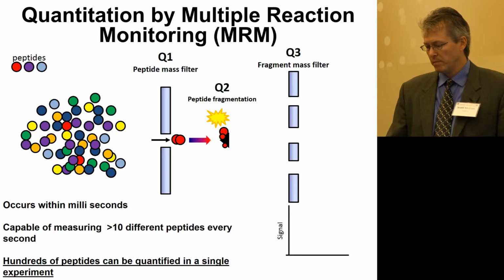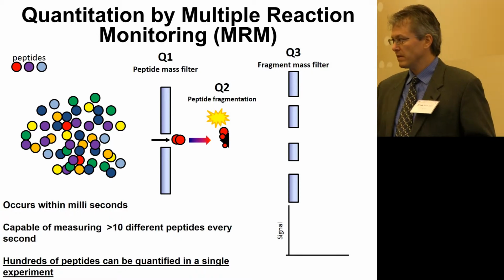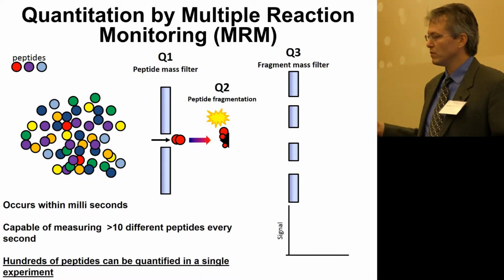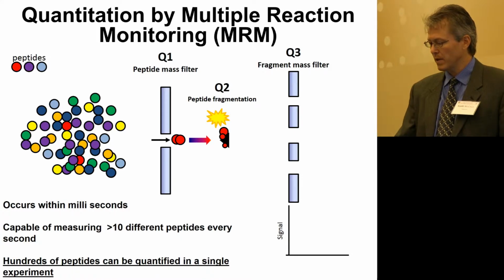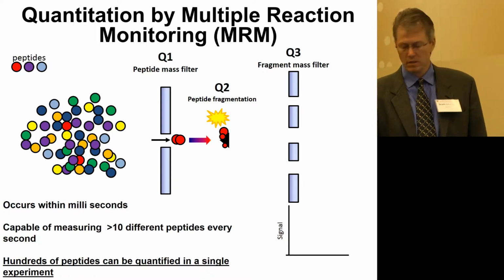Then you're going to break the peptide bonds. They're fragmented to provide the amino acid sequence information. And so that final signal is specific for the peptide of interest. Mass matters and gives you the sequence information. They can keep track of that and measure it. And then you do get the signal there at the bottom, which can be quantified.